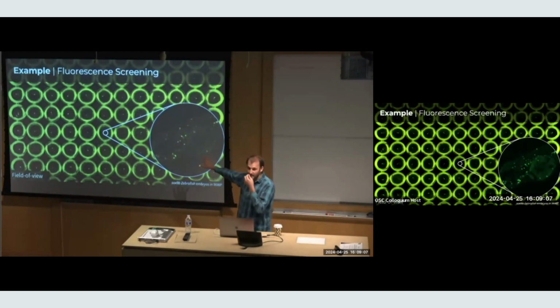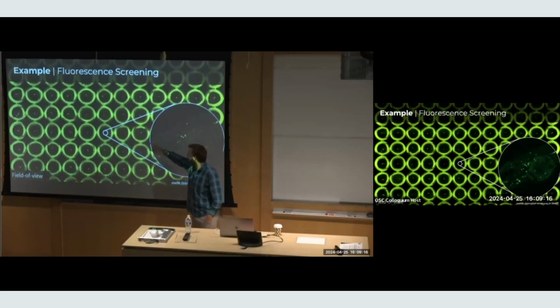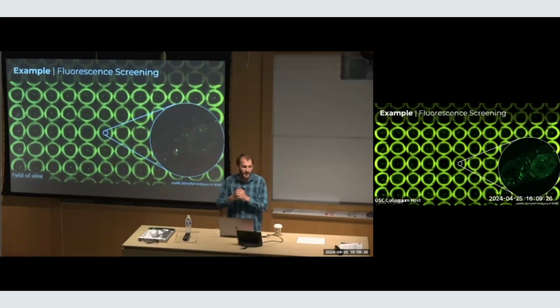So we can image in fluorescence in this modality where everything's continuous. It's not great fluorescence. It's okay. So it's kind of hard to see, but each of these is a zebrafish larvae in these 96 wells. And these are neutrophils that are labeled fluorescently that are moving throughout the body. This isn't a real-time video. This is like one image every 10 seconds. They are moving actually quite quickly, but just slowly moving for a wound healing assay where those cells are moving to go help with a wound.